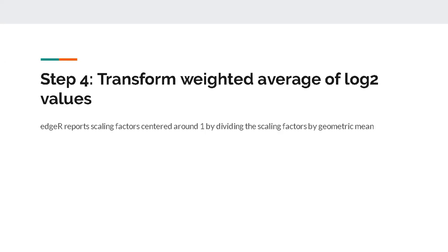And if you have a sample where you have more lowly expressed genes, the scaling factor, because you have weighted these trimmed means, would bump your effective library size to a higher value, just to take care of that RNA composition.